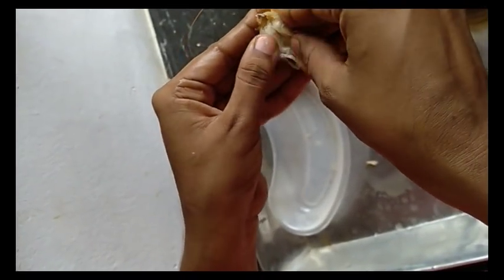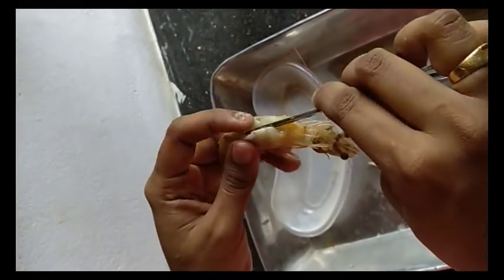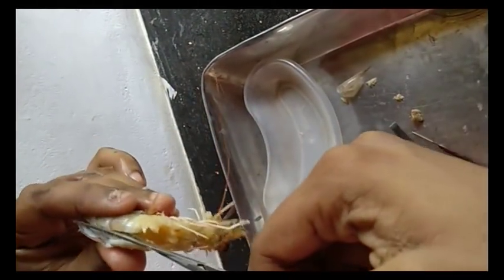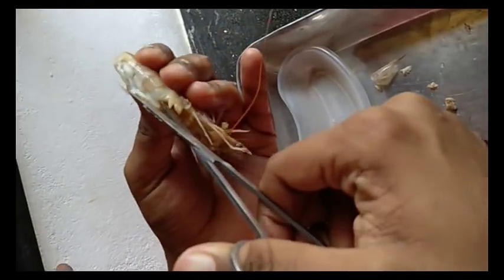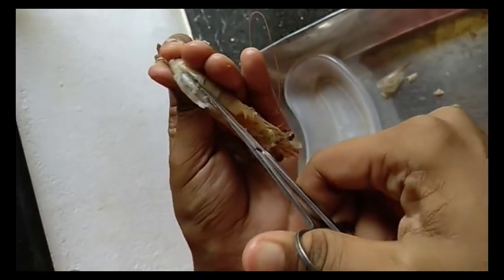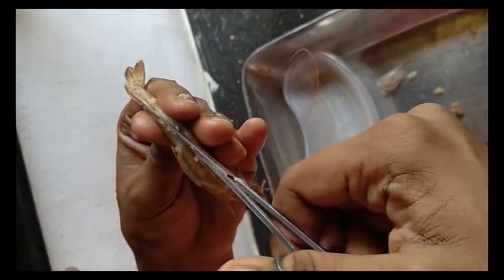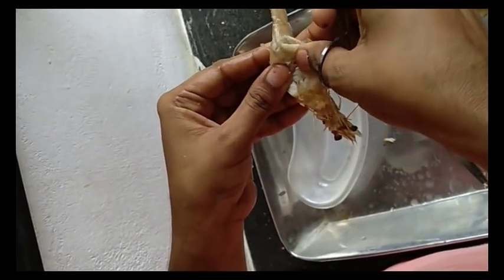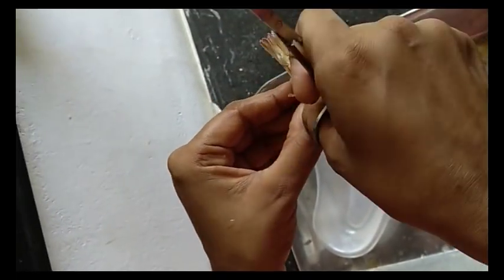When you open it, you can see muscle mass. The muscle above is called the extensor muscles. I have made a cut through the extensor muscle of the prawn. Extensor muscles. And while we open it, you can see flexor muscles. Below, you can see flexor muscles.